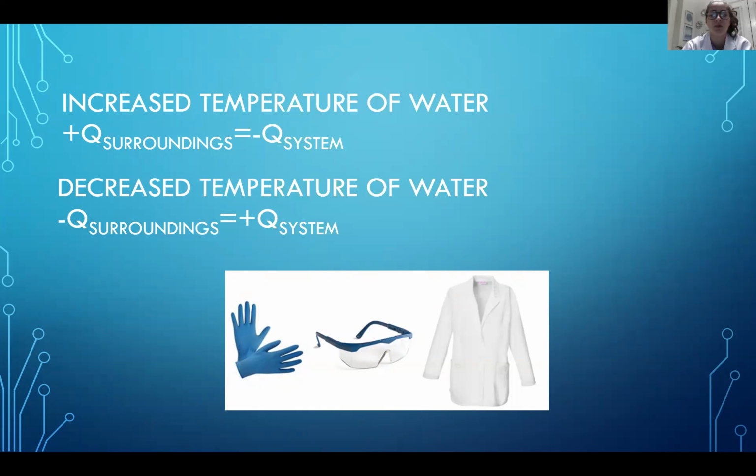One tip for more accurate results is to remember to quickly put the lid back on top of the coffee cup after placing all of your reactants into the calorimeter. In addition, after you finish your experiment, remember to dispose of the chemical substances you dealt with appropriately, and remember to always wear your proper PPE when dealing with chemical substances in order to complete this experiment as safely as possible.